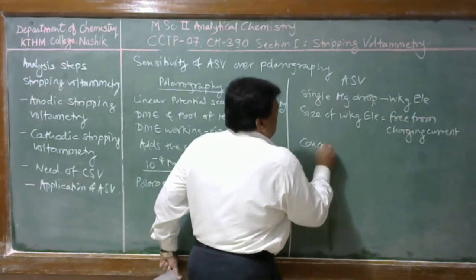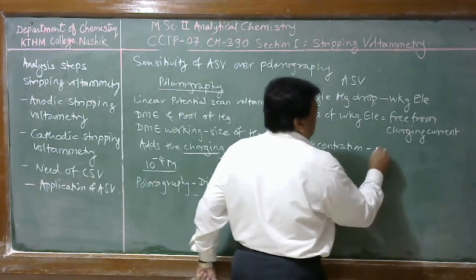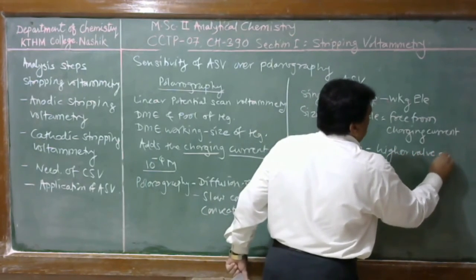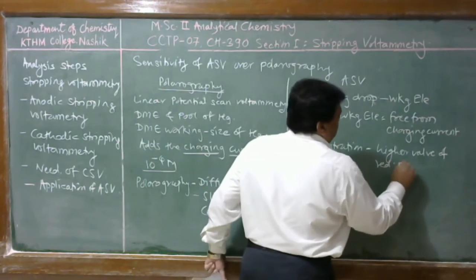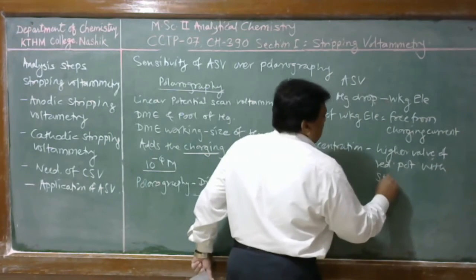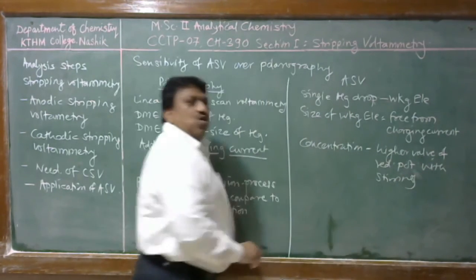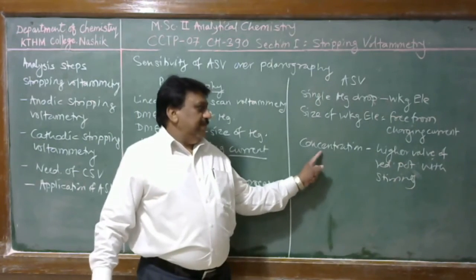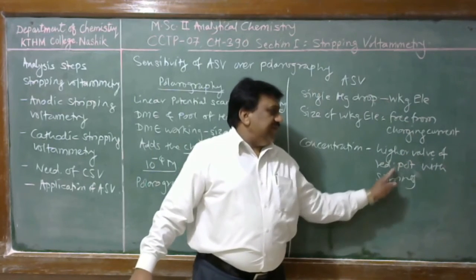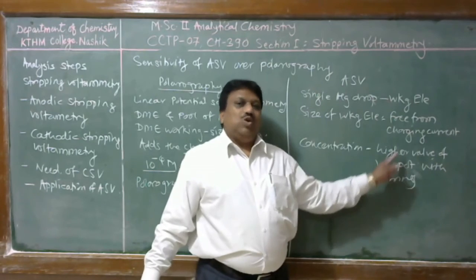The second thing is that the concentration step is carried out at a higher value of reduction potential of the analyte, with stirring, so that the analyte is quantitatively deposited onto the working electrode. Therefore, the total analyte is deposited onto the working electrode.